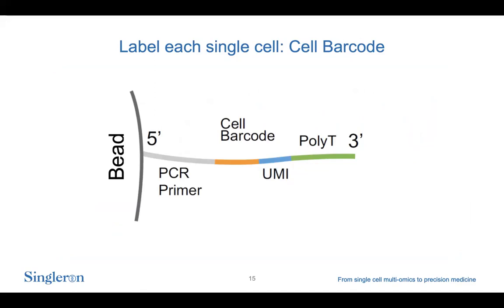As you know, mRNAs have poly-A tails. They are polyadenylated, and this poly-A tail prevents mRNA degradation. This poly-A tail is what we capture using our barcoding beads, with the oligonucleotides on their surface.